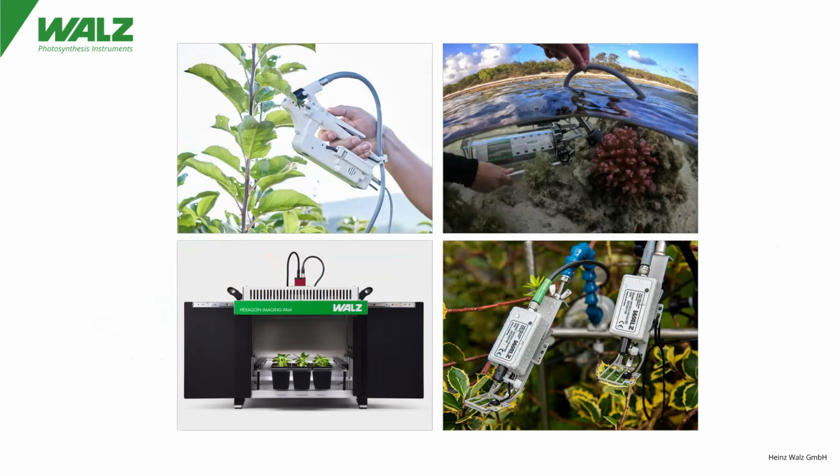Chlorophyll fluorescence can be measured using modern chlorophyll fluorometers. Walz offers PAM chlorophyll fluorometers for a wide range of applications. Instruments are available for laboratory use, monitoring underwater applications, and imaging systems. The system supports single-point measurements, suspension measurements, and spatially resolved imaging of leaves and whole plants. Measurements are based on the PAM technique, enabling sensitive and quantitative analysis of photosynthetic activity.